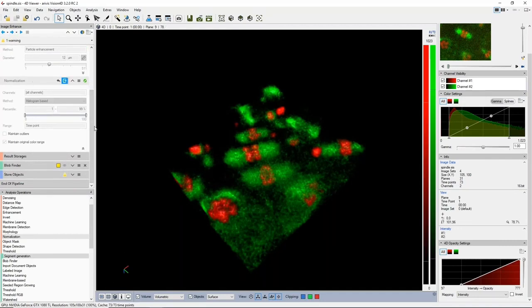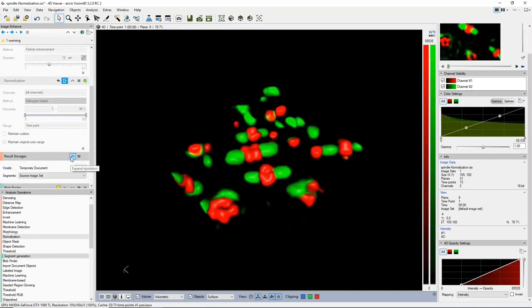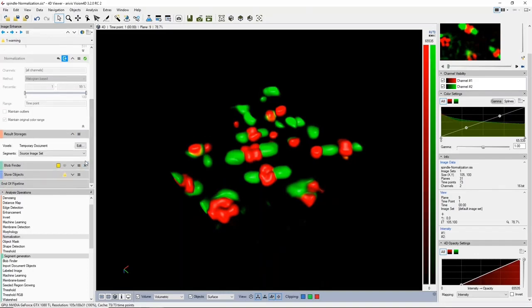Okay, so if I go back to my results, as always, we have the option to choose how we store the results. So just a quick reminder for anybody who missed the first meeting, it's always very important to make sure that you have lots of space on your hard disk to store the results of voxel operations, any kind of operations that process the image.